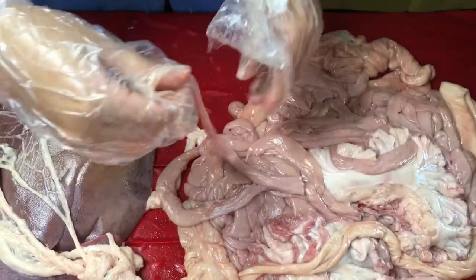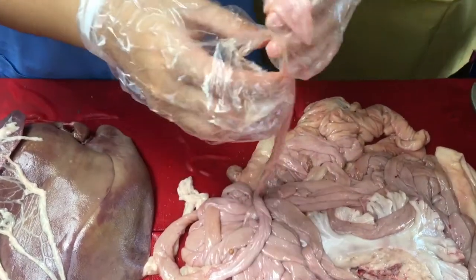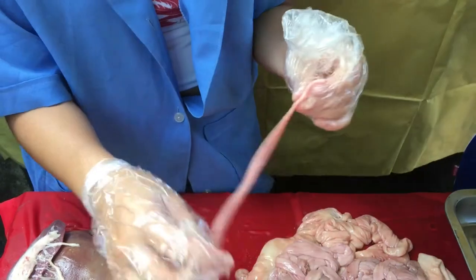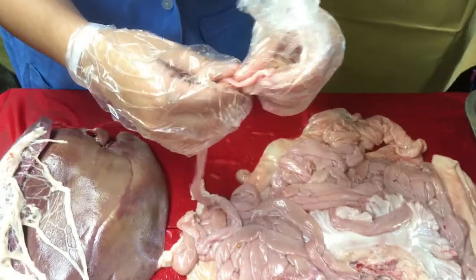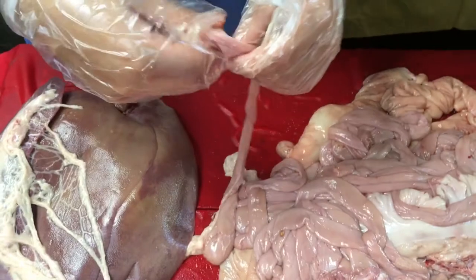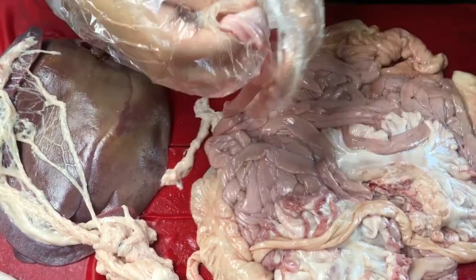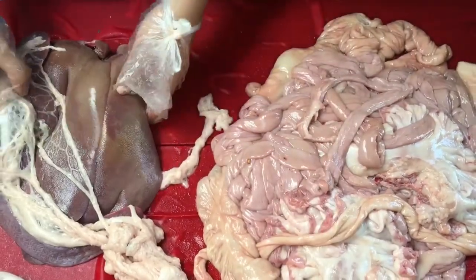This is the beginning of the small intestine. This connective tissue within the small intestine is called the pancreatic tissue. We all know that pancreatic tissue produces enzymes that are essential for digestion, so that we really begin the major phase of chemical digestion of the materials. The other organ that contributes to digestion at this point is the liver. So we are done with this, and we will now move on to the liver.